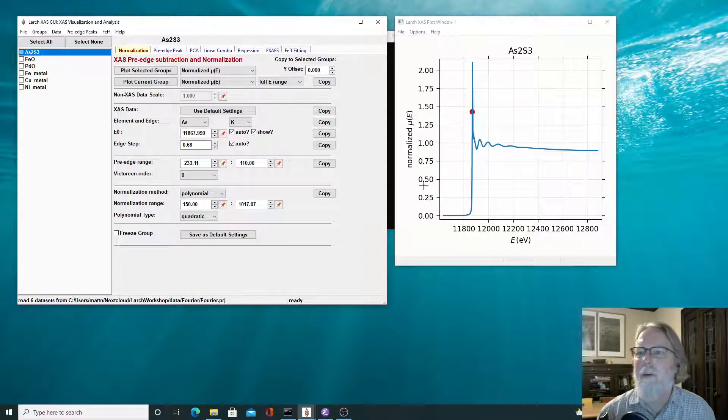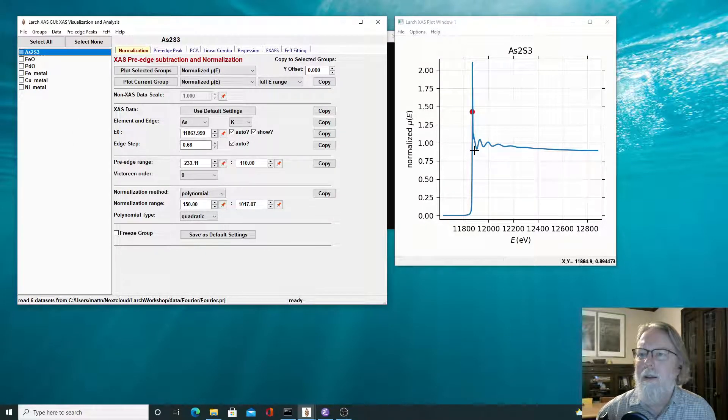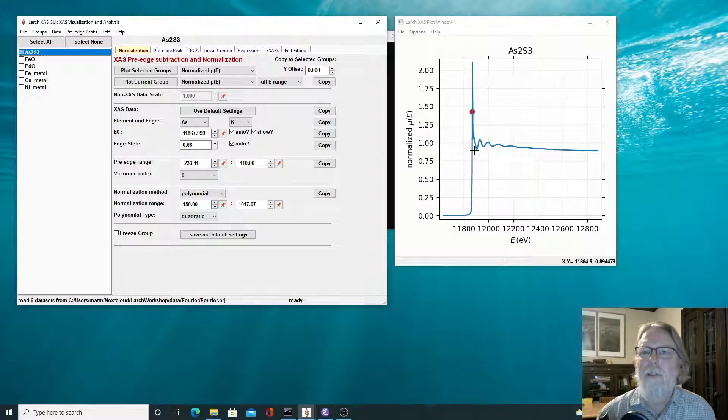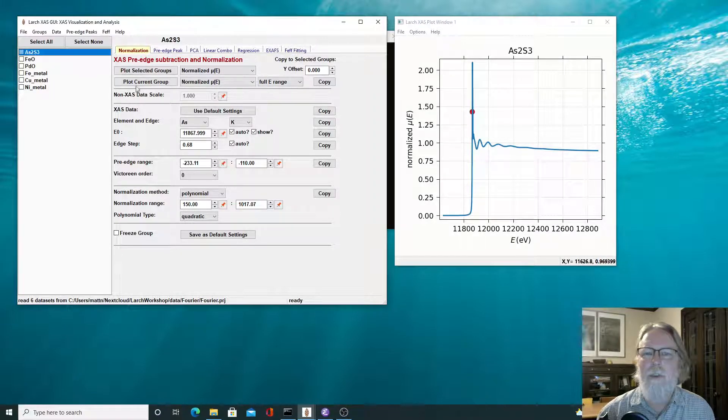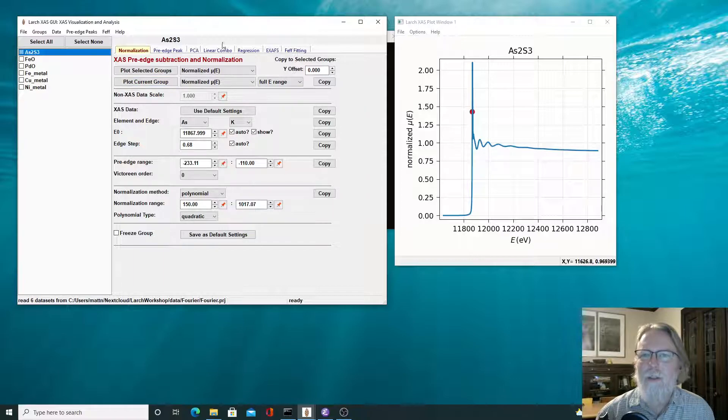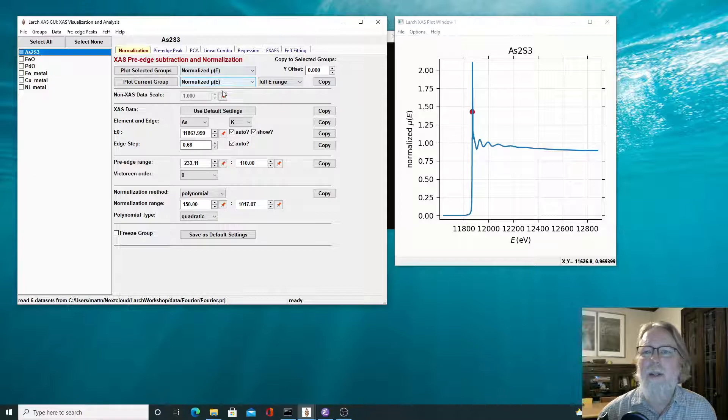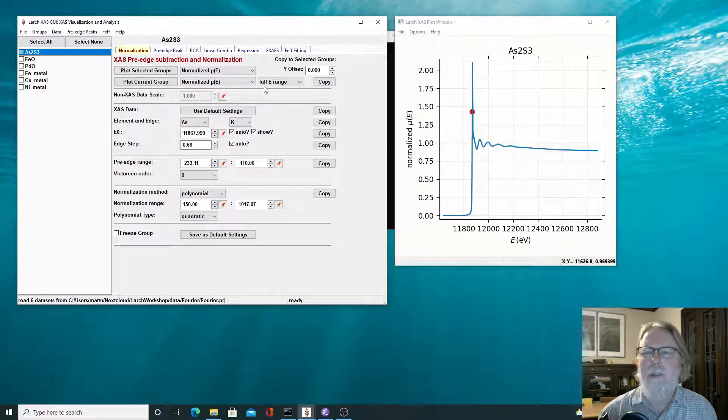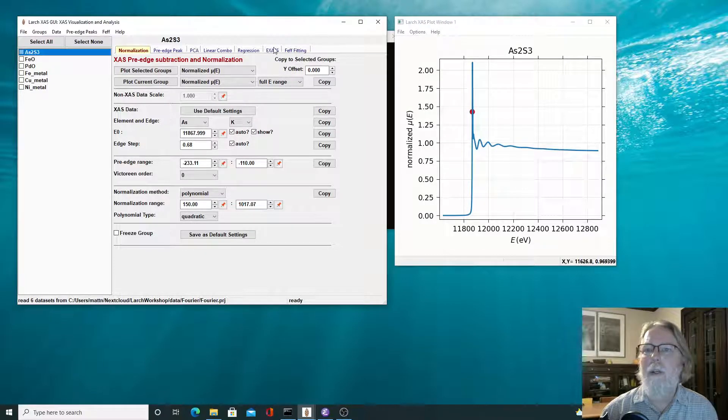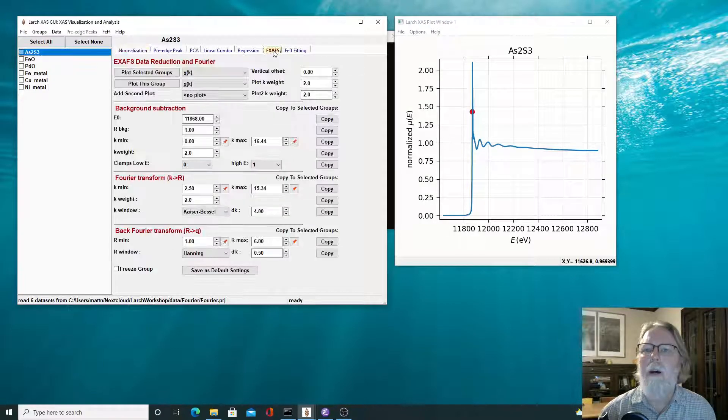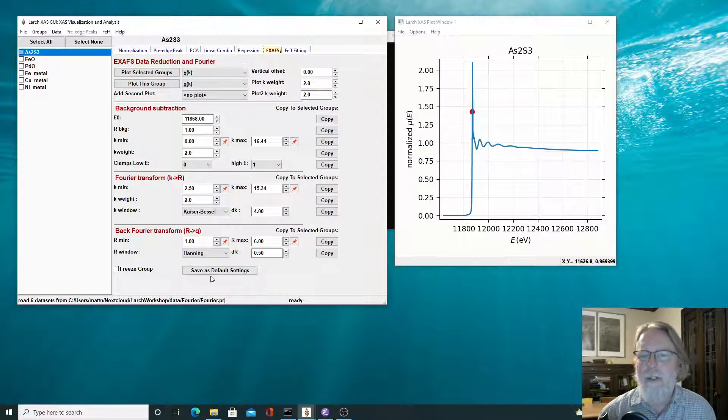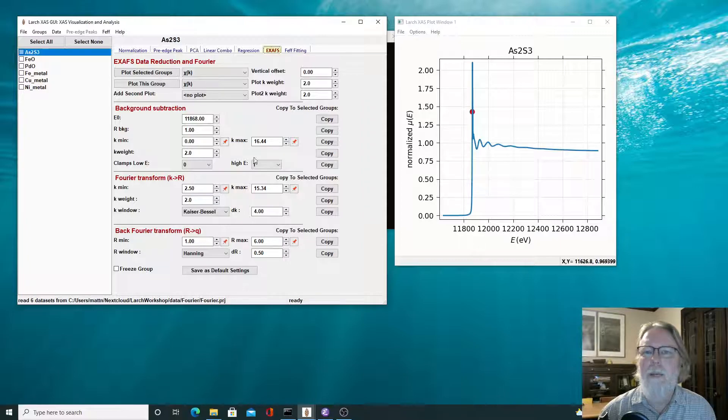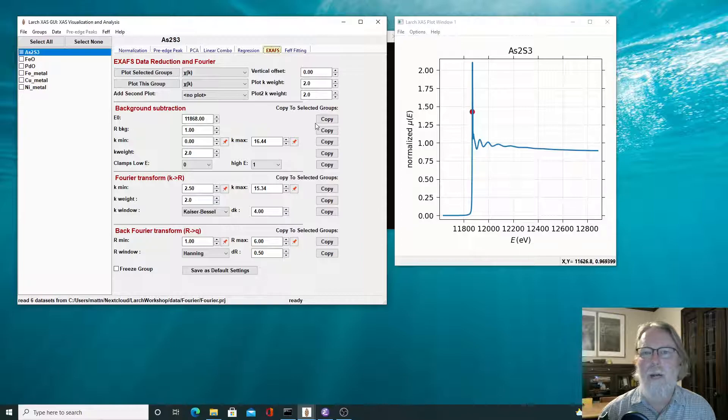So we'll start with the simple arsenic sulfide. We have nicely normalized XAFS data, and in Larch's XAFS viewer, it starts to do the normalization sort of in an automated way automatically, so it usually comes up with defaults that are decent enough to use. And then we can just go and click on the XAFS tab here, and this is a complex page.